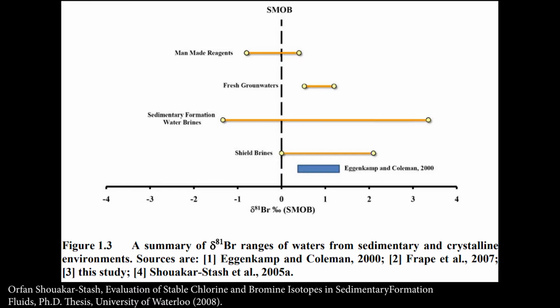What this means is you can take a sample and break it into its elements, and then look at its relative isotopic composition, in this case, the ratio of bromine-79 to bromine-81. That can potentially tell you where that stuff came from, or give you some idea of where it came from. That is powerful and has been incorporated into forensics, but how useful it is in terms of evidentiary value is certainly still up for debate, but it is being used in forensics.